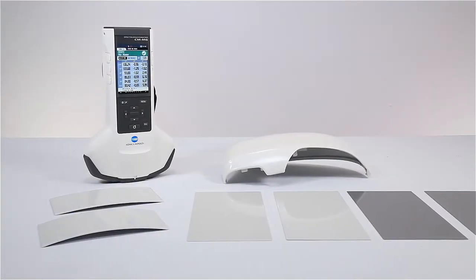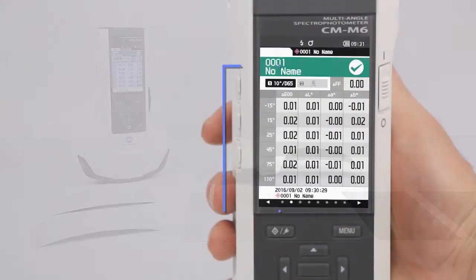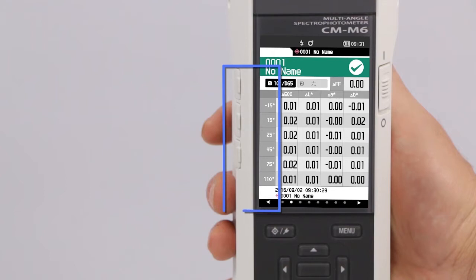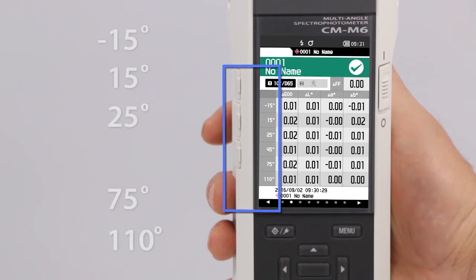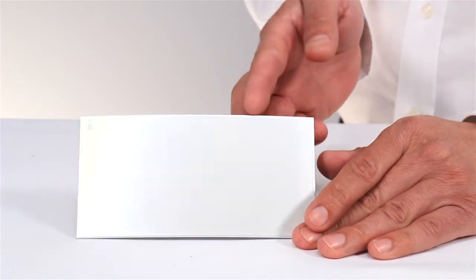The CMM6 provides measurement data at 6 selectable angles, ideal for capturing finishes that exhibit visual changes at different angles.